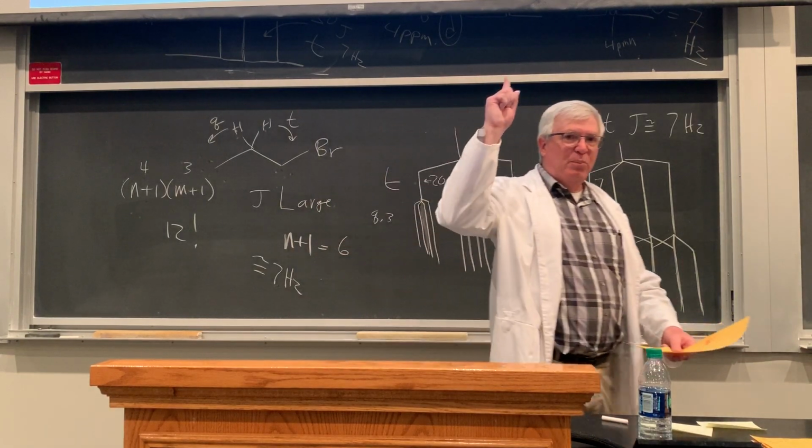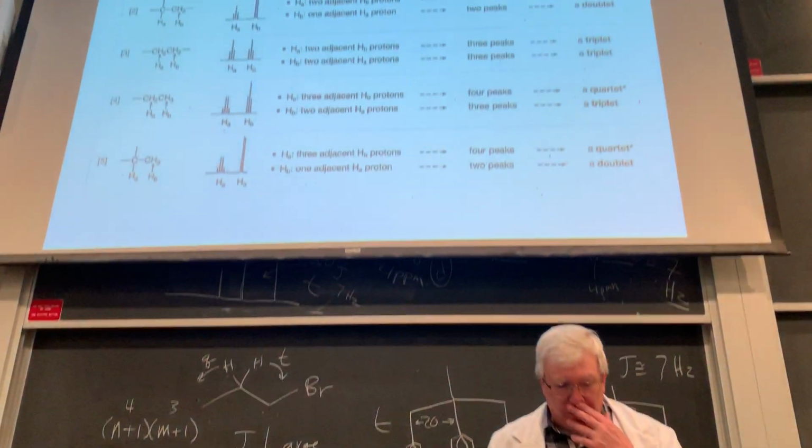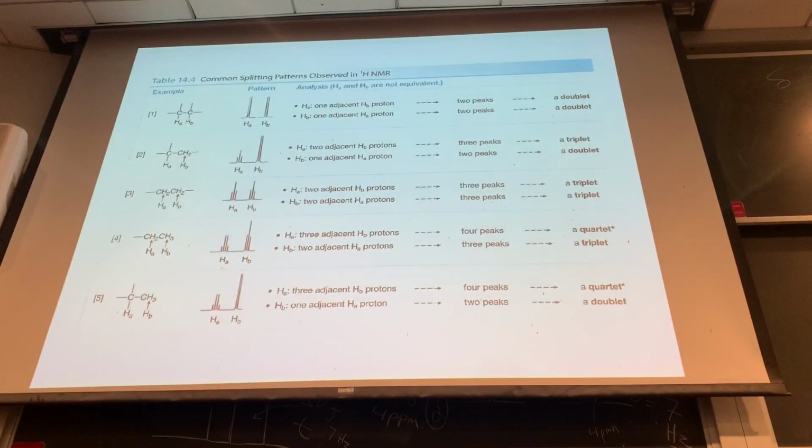Let's look at the actual spectra for this molecule, and hopefully it'll become a little more clear. So going up there again, Isaac, we've got some typical splitting patterns here for 2 methines together, 2 doublets.